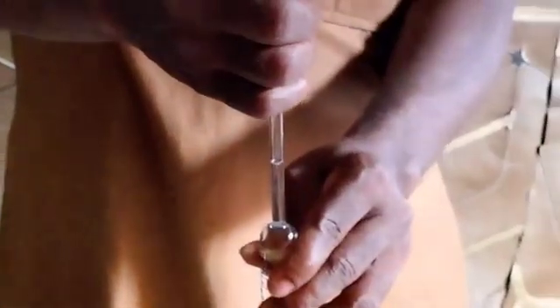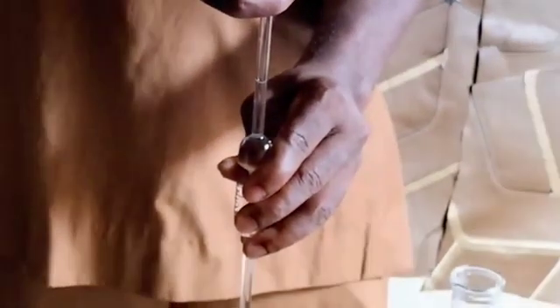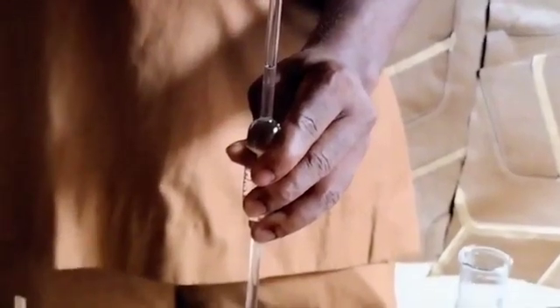This is the base already in the pipette. So move your hand a little to allow the base. So we adjust the base little by little. It's going down slowly.